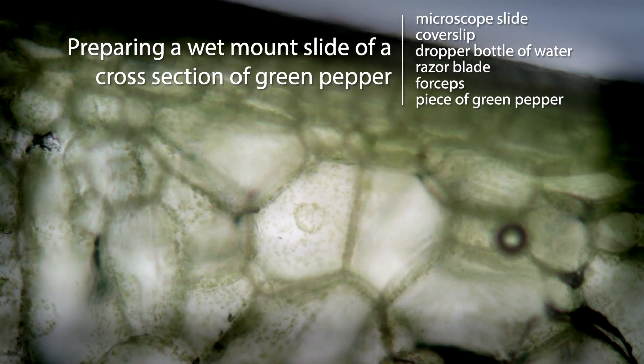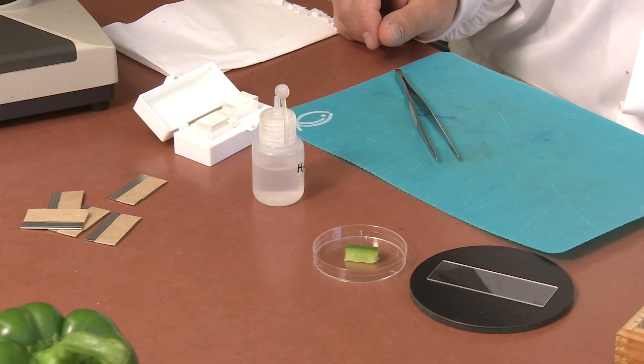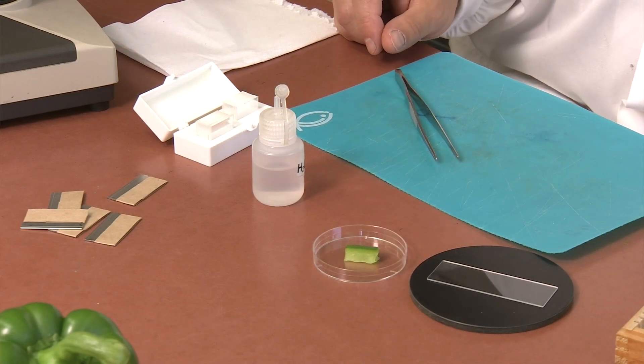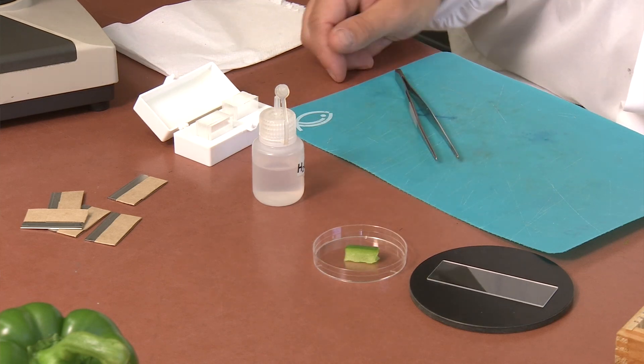Hello and welcome to the tutorial video for preparing a wet mount slide of a cross section of green pepper. In addition to slides and coverslips, you will need a piece of green pepper, a razor blade, and forceps provided at the side bench.